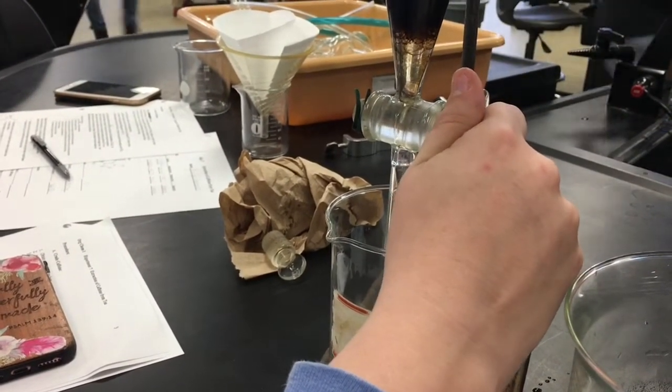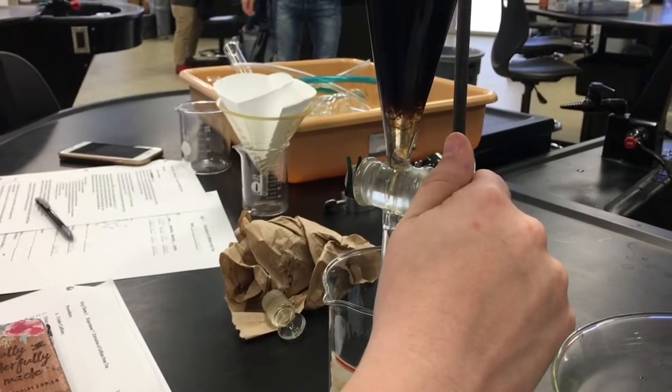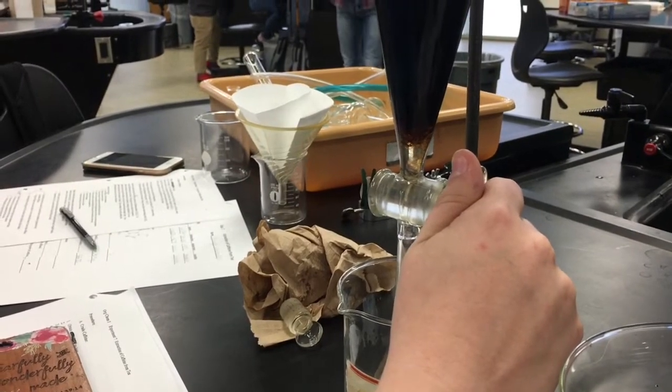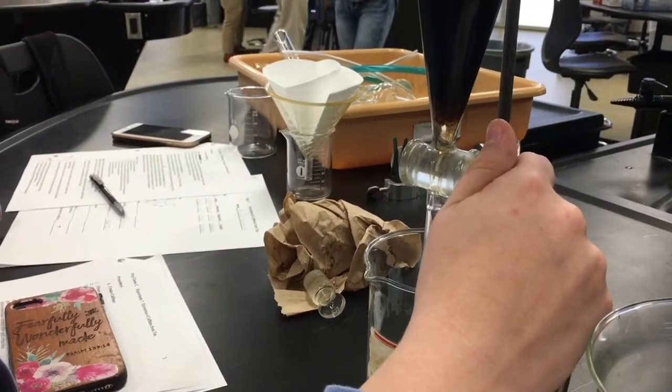I think that's what the stuff that you add to it at the end is for — it'll dry out all that and it'll fall out. The filter paper will get it. It stinks.